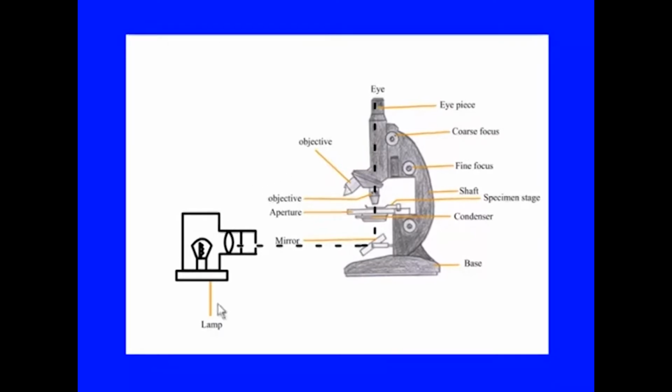Now, as we go along with the different components of the microscope, the first thing is the light source, a uniform bright light source, which is placed either externally, like shown here, or it could be mounted in the base of the microscope, right below here. Now, there is another lens system, the condenser lens system, which collects the light from the light source.